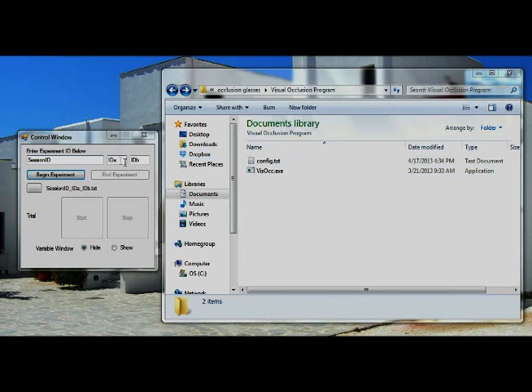The first three boxes are where you label your file name, and you can see down here the format of how the file name will be saved. So you can go ahead and change these to whatever you want, say experiment 1, label that a 2, and label that a 1. And you can see down here what the output will look like.